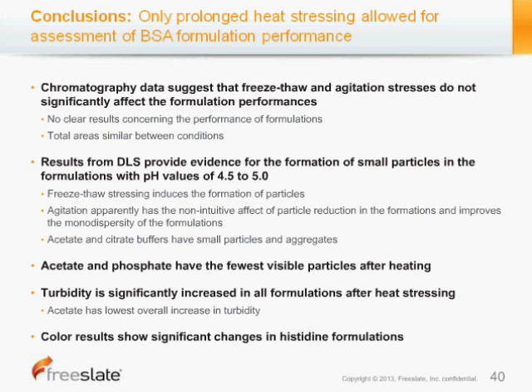The results from the DLS do provide a little bit of evidence for formation of small particles in formulations that have lower pH values. In this case, freeze-thaw was able to give us a little bit of information about formation of particles, but there wasn't a lot to speak about here, either with freeze-thaw or agitation.